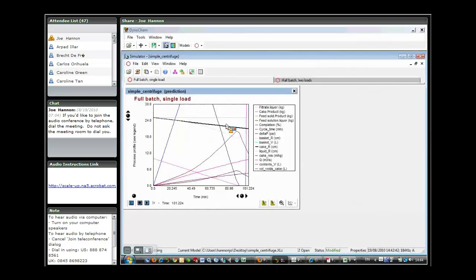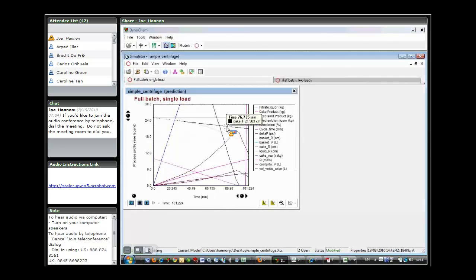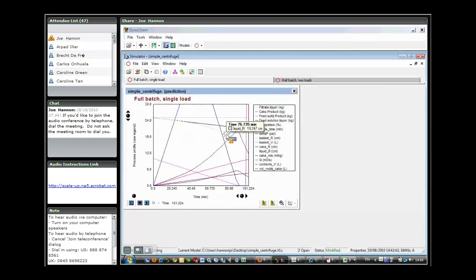The cake radius indicates the thickening of the cake. This is really the outer radius of the basket. This is the radius within the outer radius, which contains solid material, or really cake. And then the grey curve is the material outside of that, or further into the centrifuge, which contains liquid.